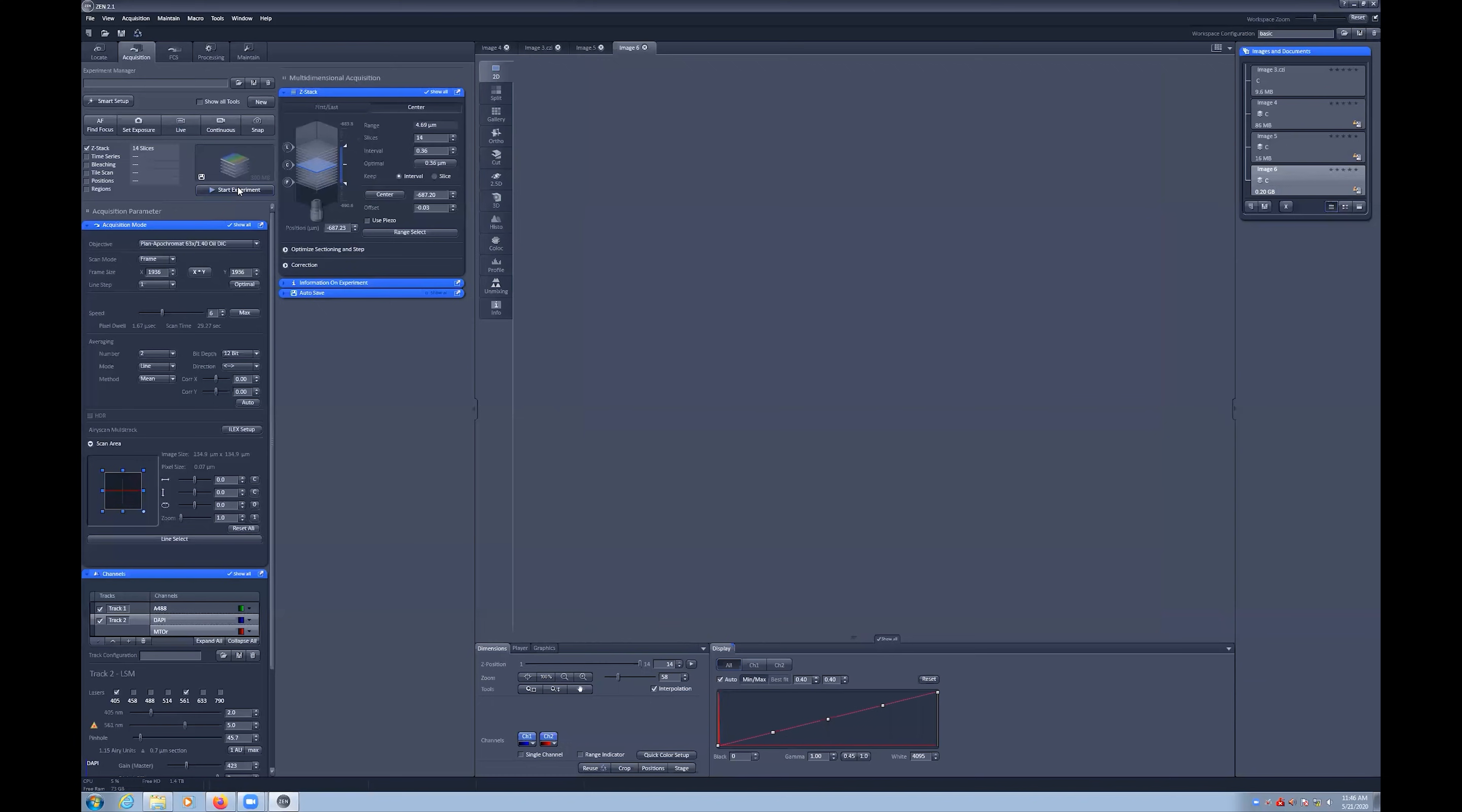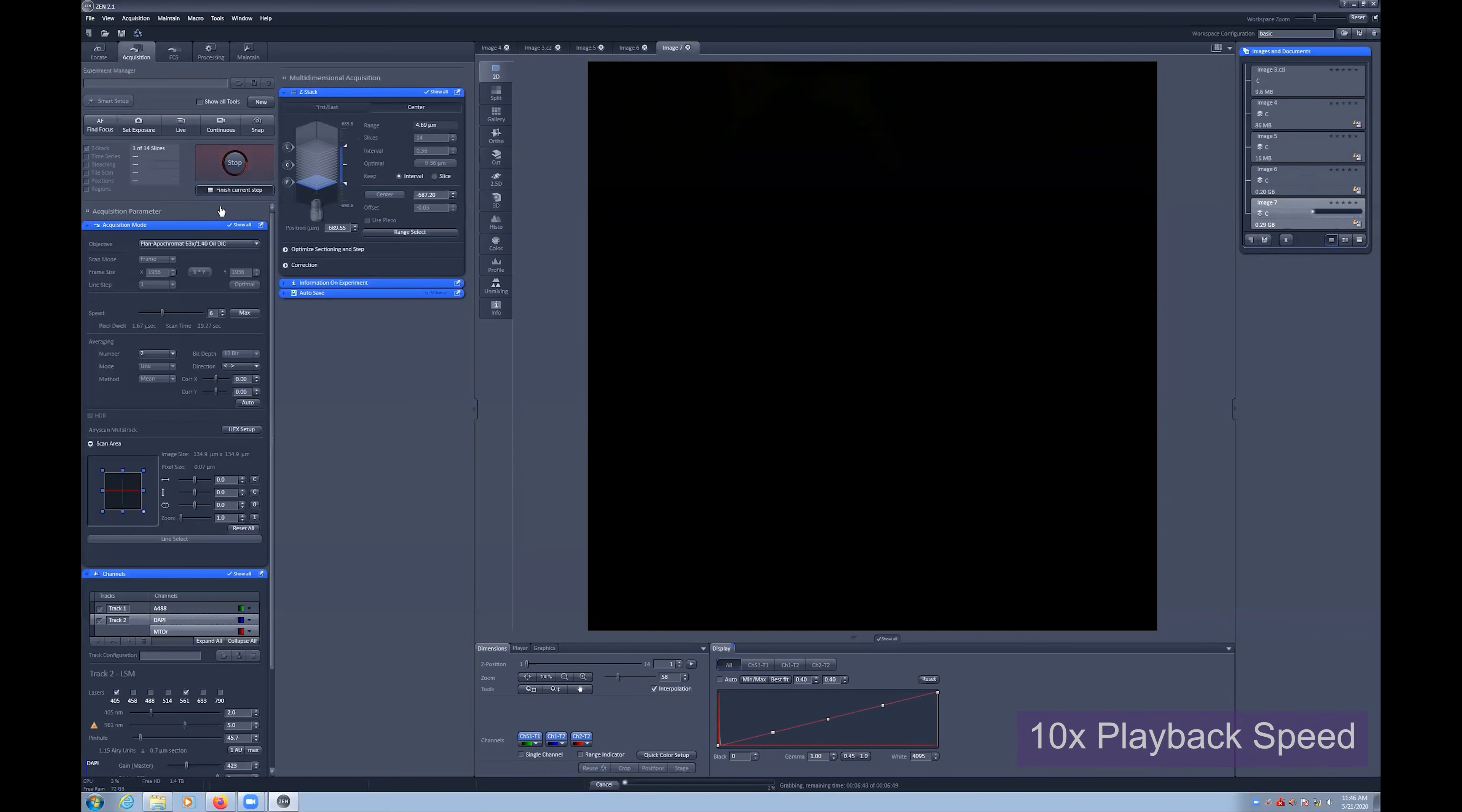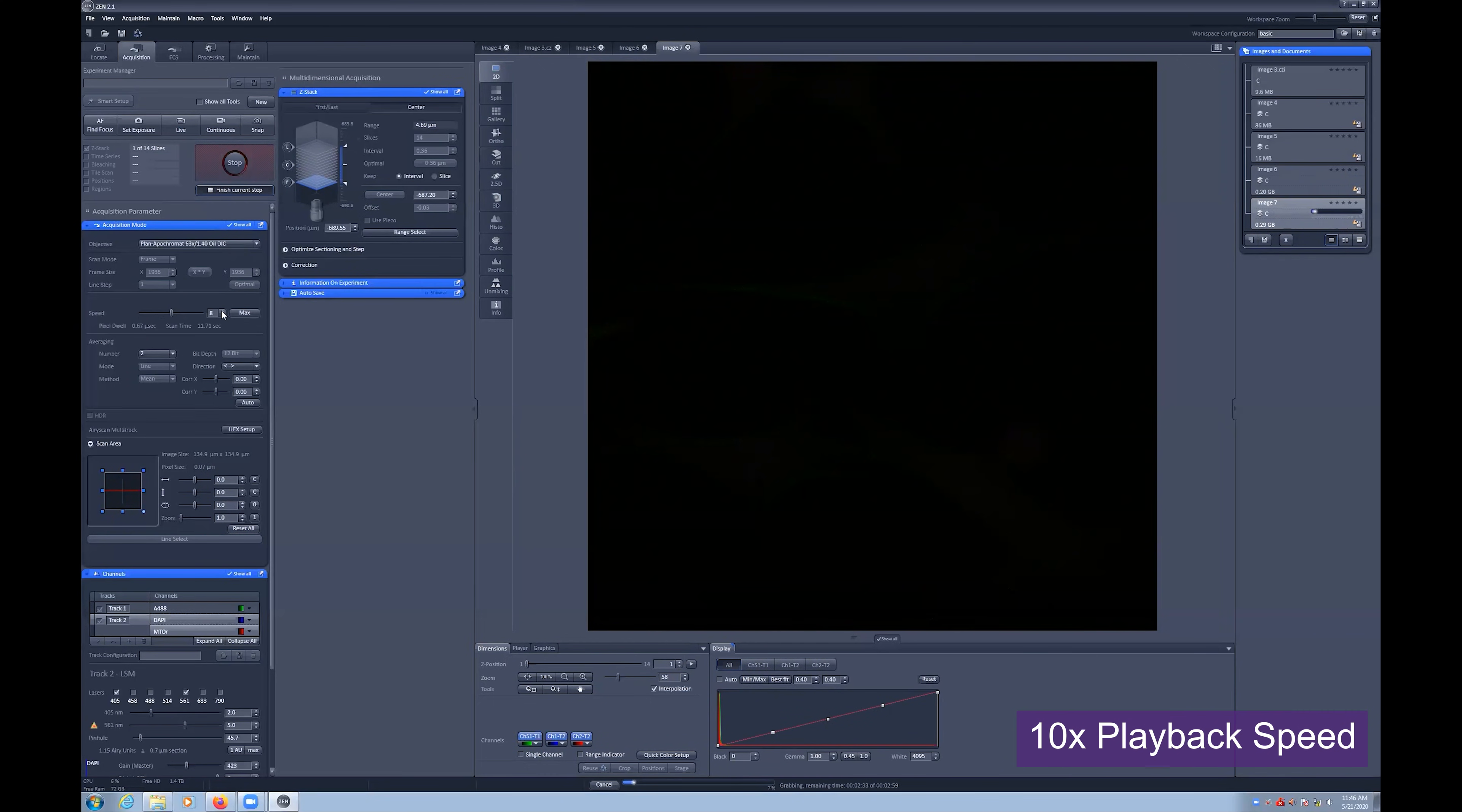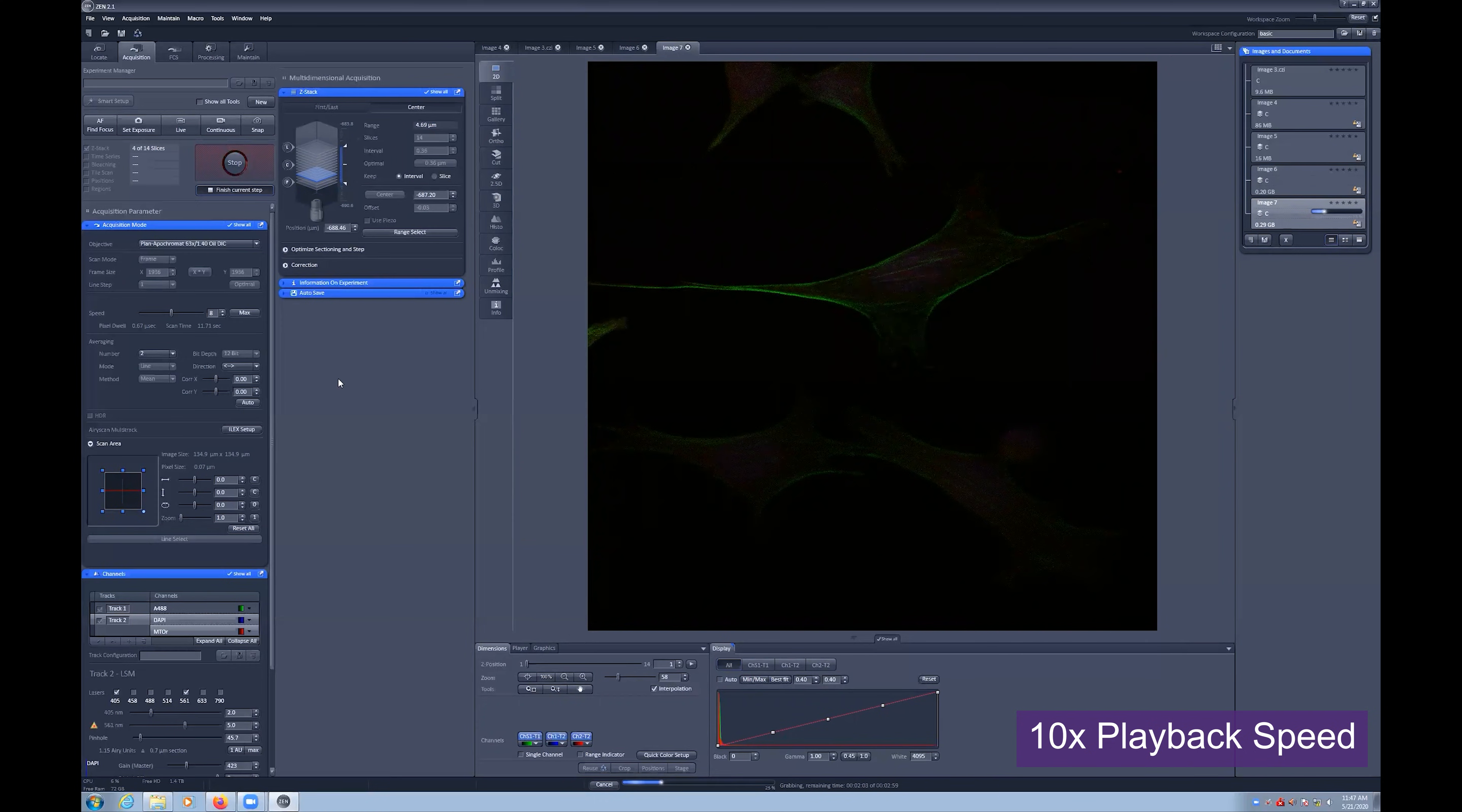You can again select the start experiment to capture the Z-Stack. Note that this capture has been sped up.